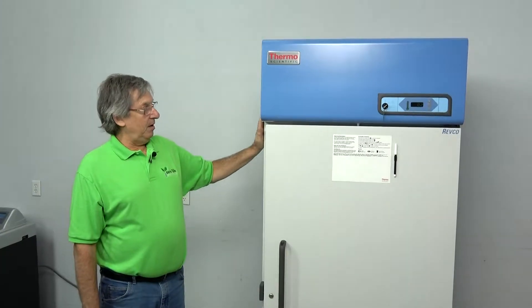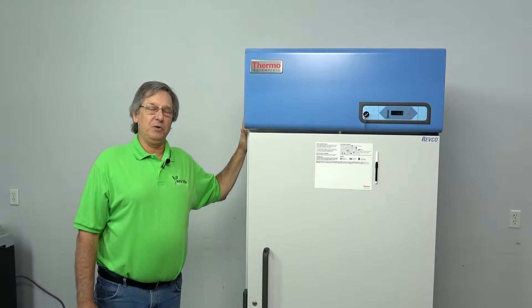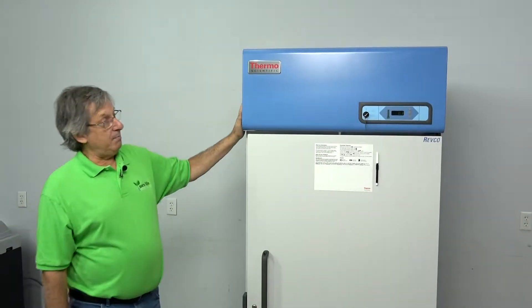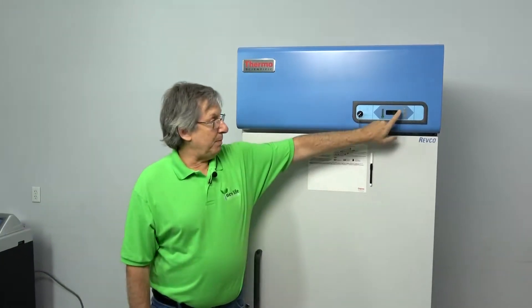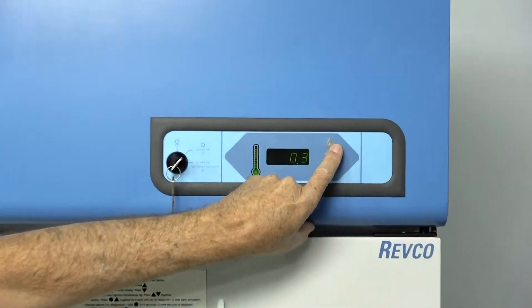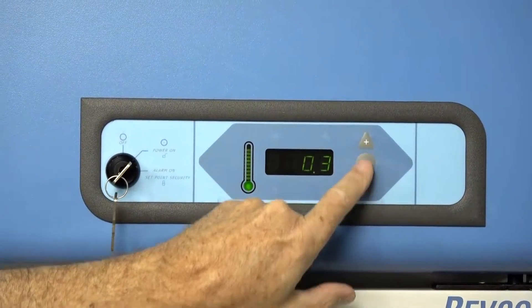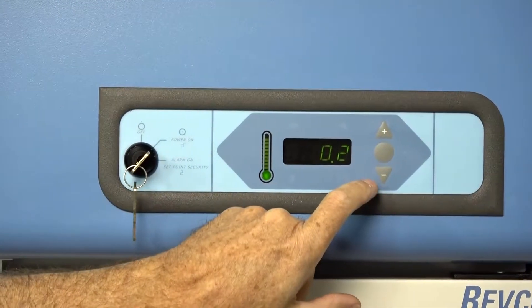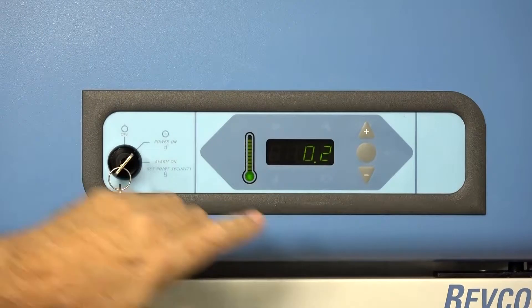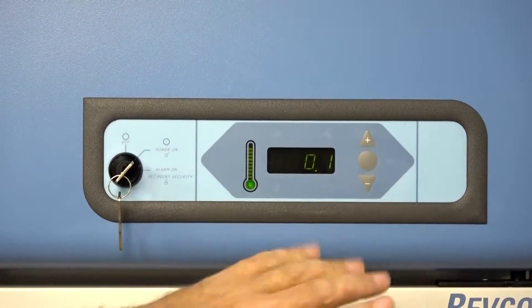This unit has alarms to let you know if it goes above or below your set points, and memory so you can easily, by pushing a button, see what the last cold and warm temperature was, or if it went over, what the last highest and lowest setting was. You can set your alarms with a single button to get into the menu and your plus and minus.